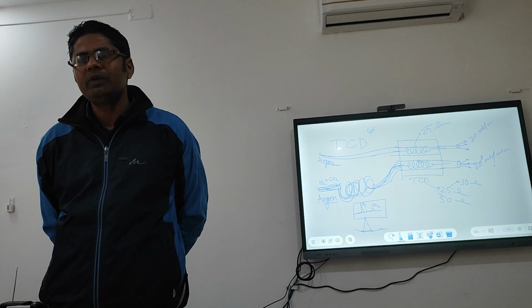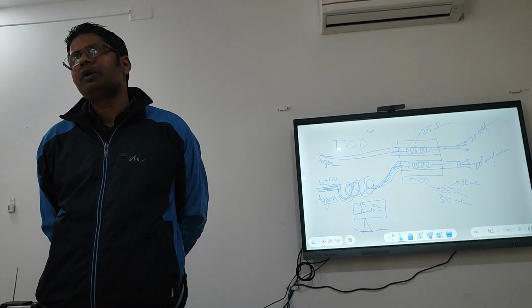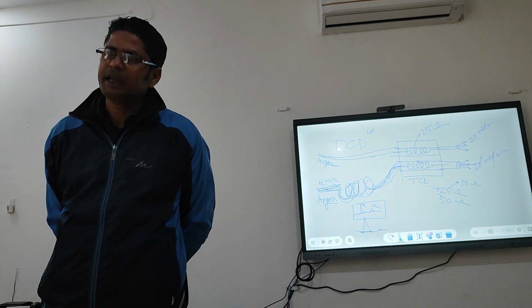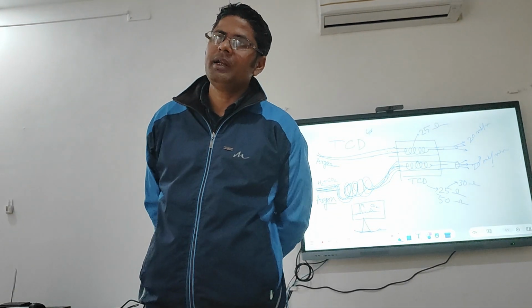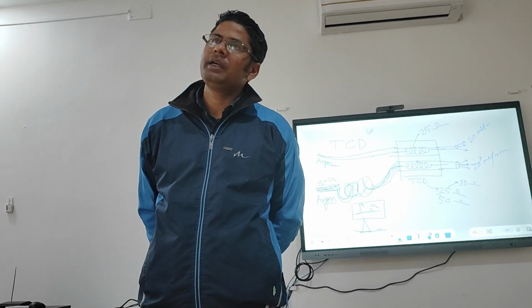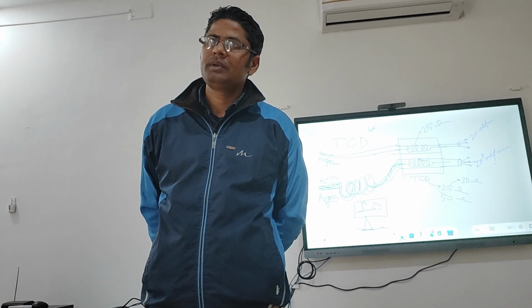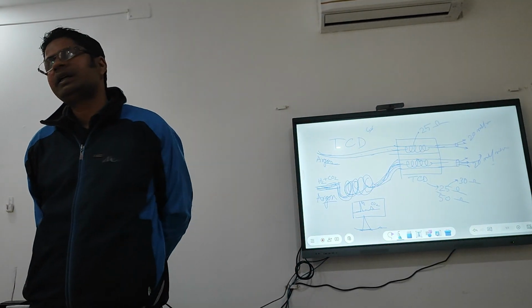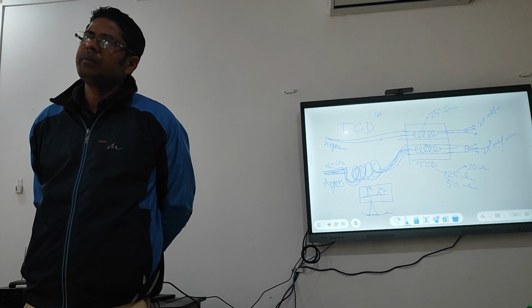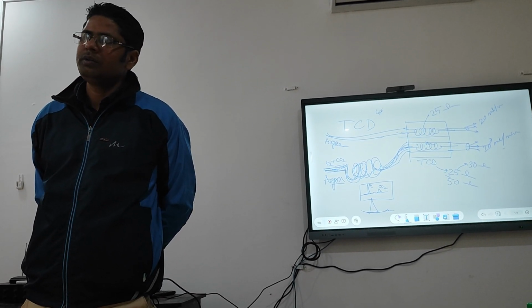And sometimes you can get double peaks of the same component in both detectors. If your sample contains methane at percentage level, that will give a peak in TCD and at the same time will give a peak in FID also. Because methane is a hydrocarbon, it can be detected in FID very well, and as it is at percentage level, it can be detected in TCD at the same time.